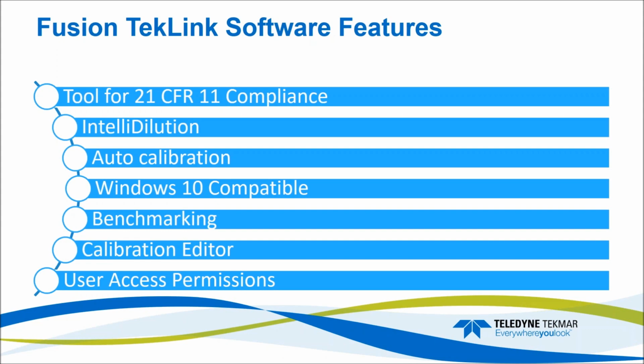It has this great benchmarking tool. So it basically checks almost everything on the instrument. You know, it'll check the autosampler for movements, the lights on the front, it will leak check it.